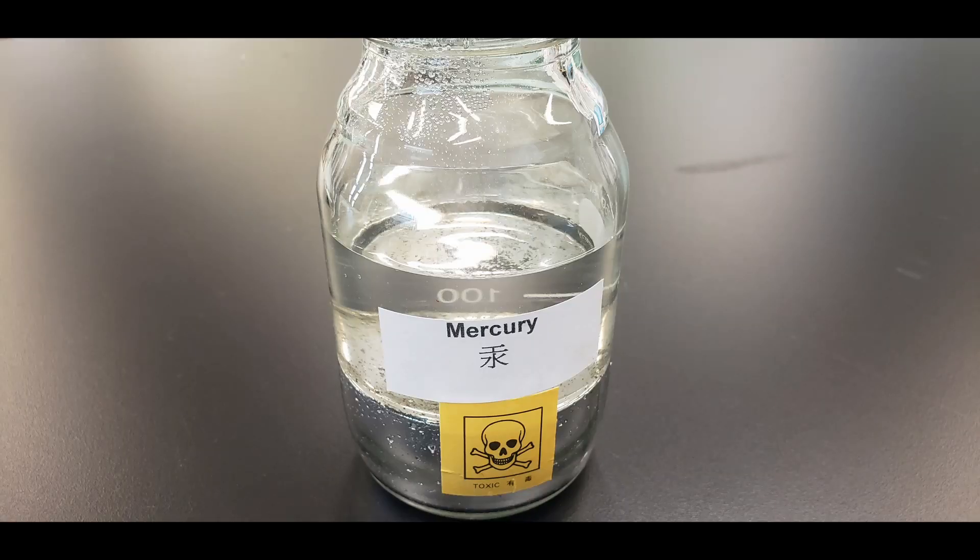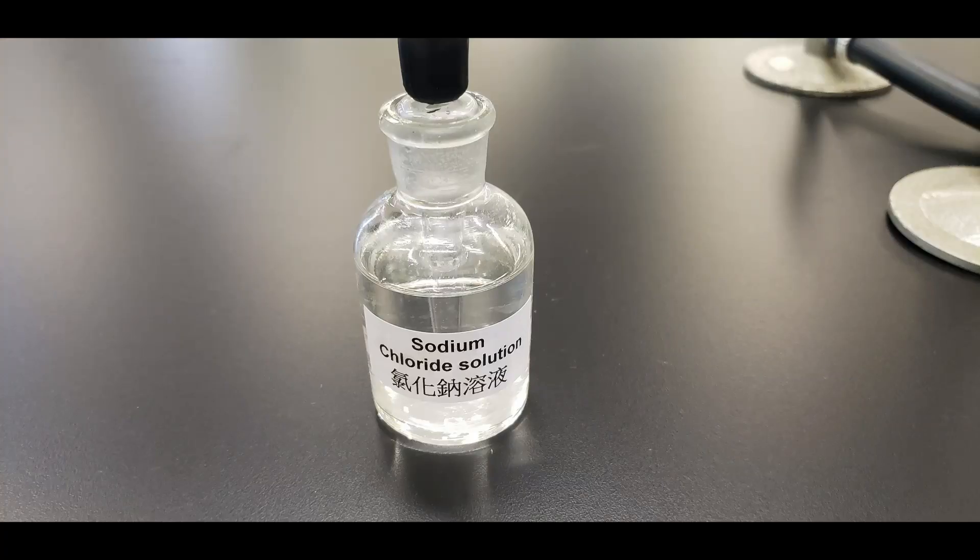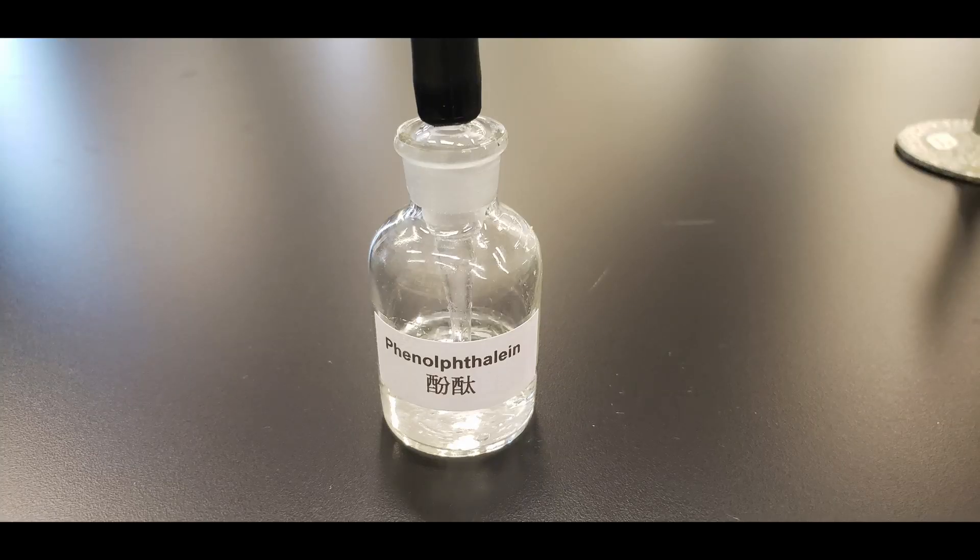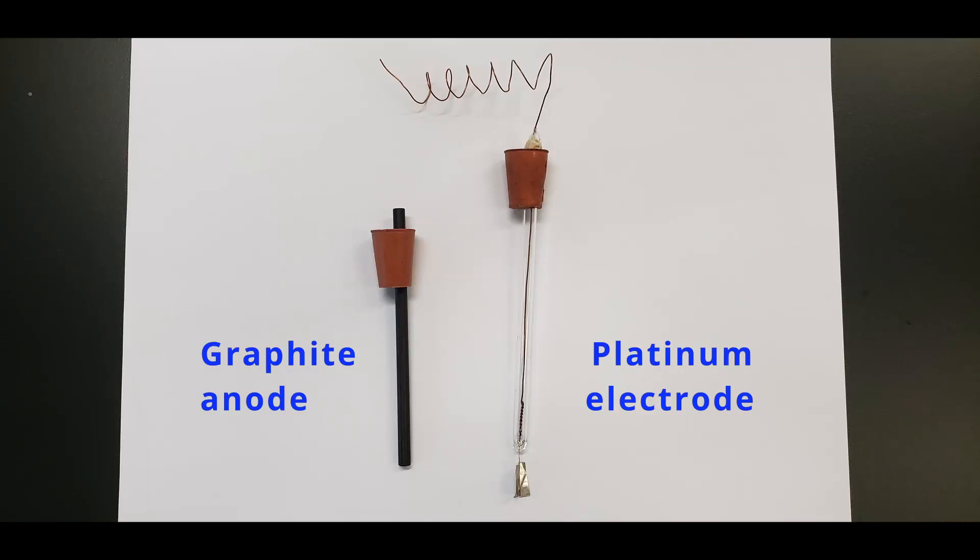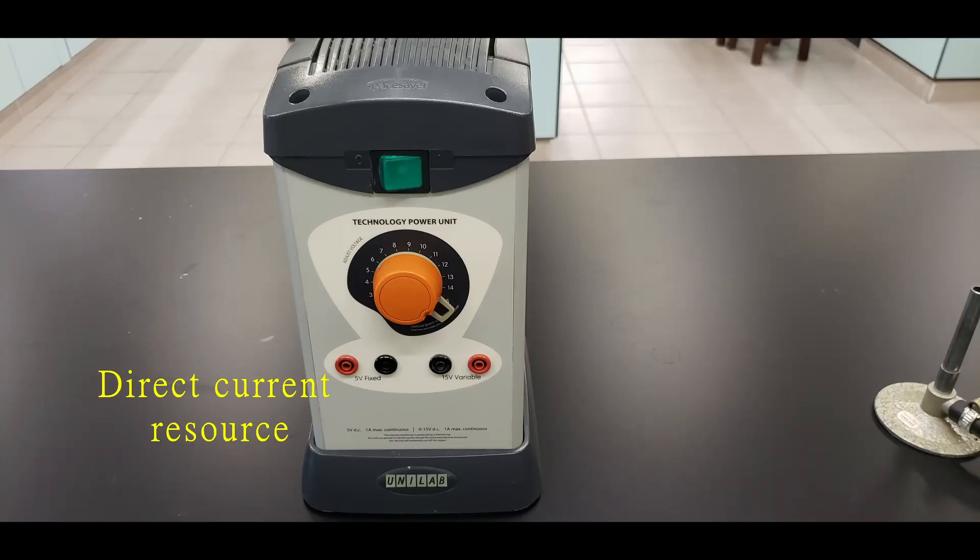Apparatus and chemicals used include mercury, concentrated sodium chloride solution, phenolphthalein, U-tube, graphite anode, platinum cathode, and a power pack is used.